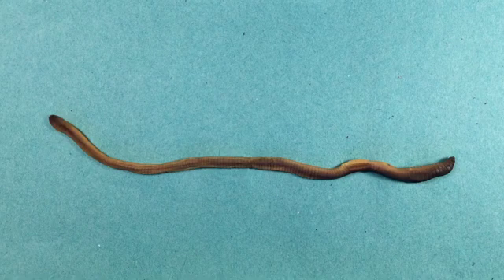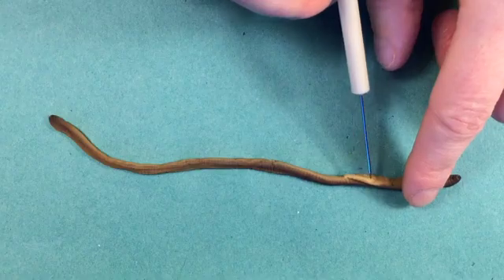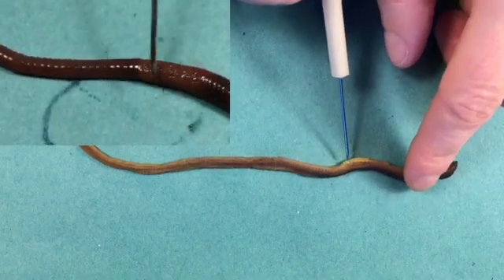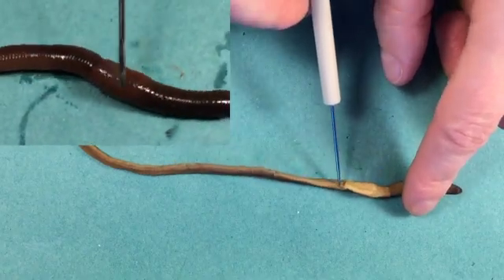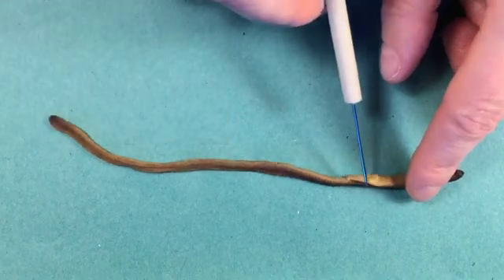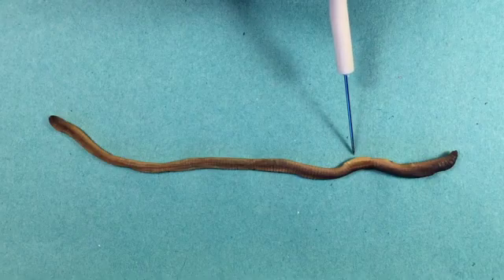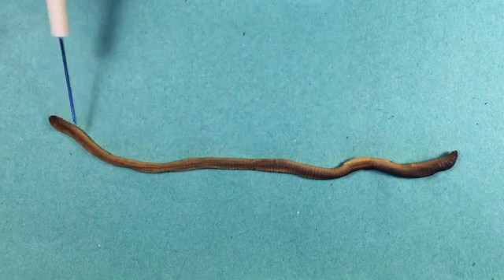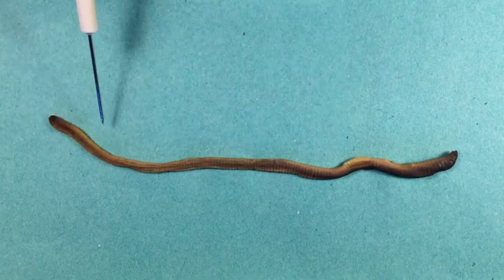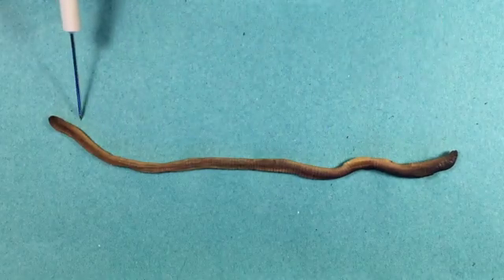Instead, what I'm going to look for is this structure here called a clitellum. It's a lighter, sometimes slightly orangey, bulbous, raised area on the earthworm. The head is actually much closer to the clitellum than the tail section. So I know that this is the anterior end and this is the posterior end.